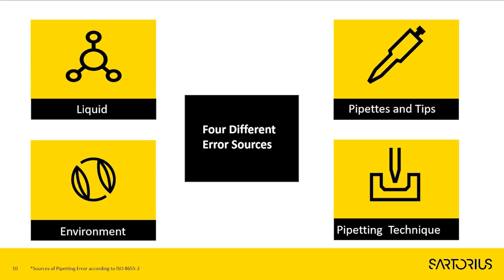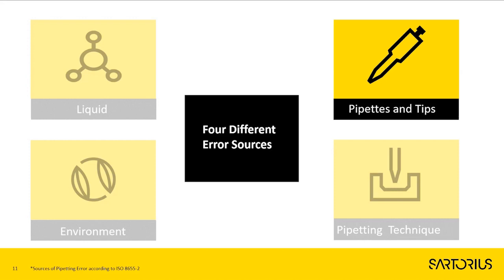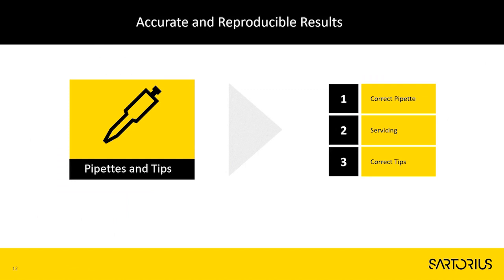ISO 8655, which is the gold standard for service, states that there are four sources of error: pipettes and tips, pipetting technique, types of liquid, and the environment. And this is what we're going to look at today individually and how we can reduce those errors. So starting with pipettes and tips, the first thing that we're going to look at is the correct pipette. The volume, so the correct pipette for the volume that we are pipetting.